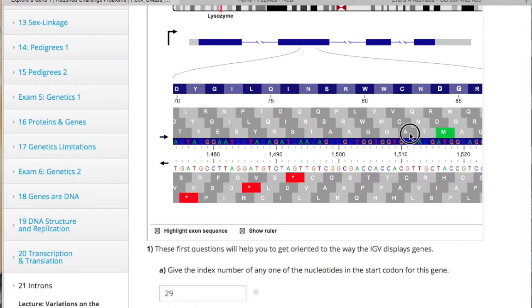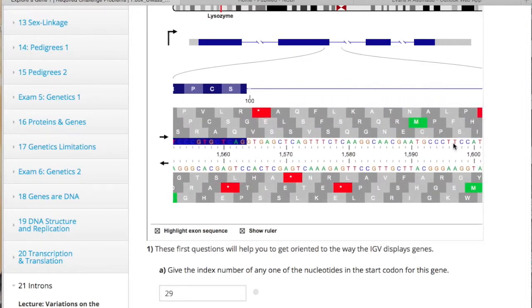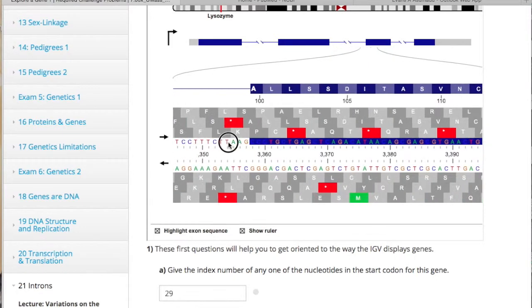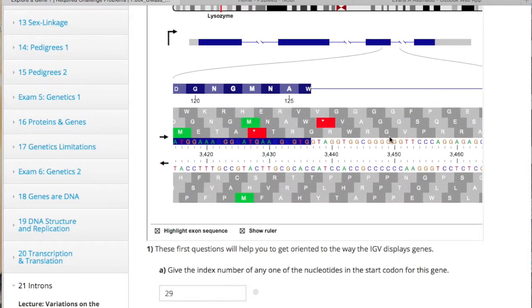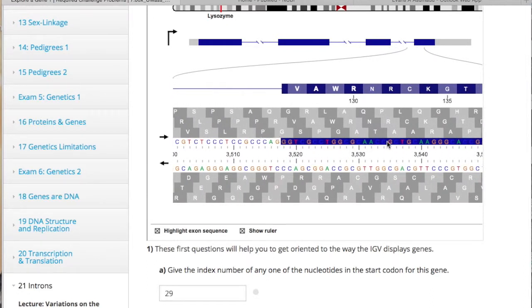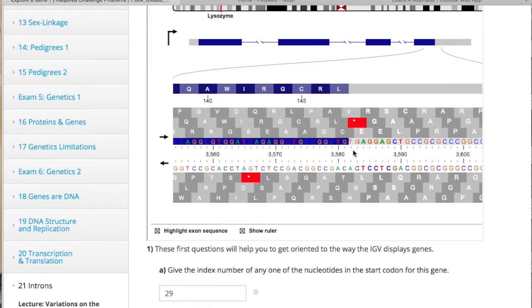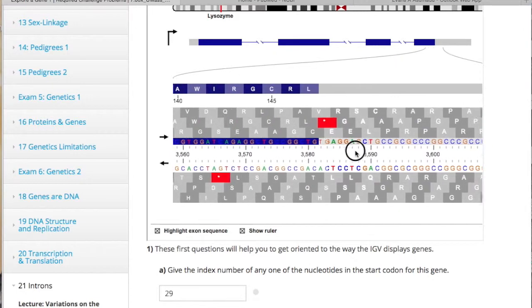So just try and stay in the range and keep it smooth and let it just go. So you get into the last part of the gene to find our stop codon. Since we already highlighted the sequence, we can tell where the last stop is, at the end of the blue line, just right here. There are no more stop codons, so we are done.